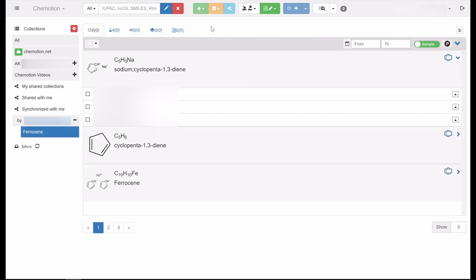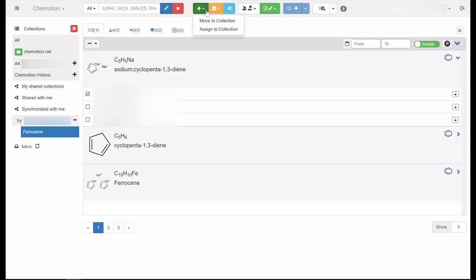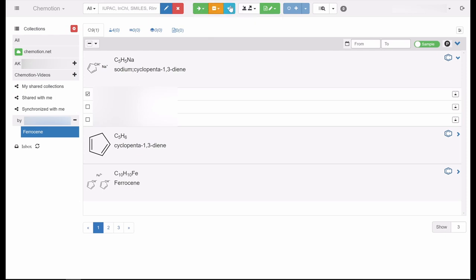The upper bar on the ELN overview page groups the possible operations which are available within the ELN. This includes a search field, as well as icons for moving, deleting, or sharing selected elements.